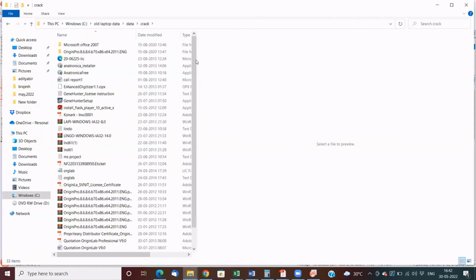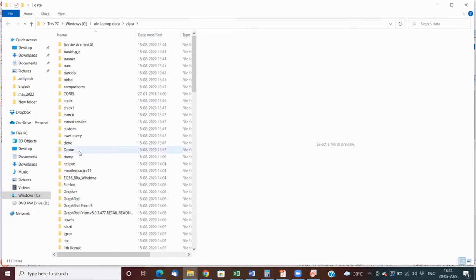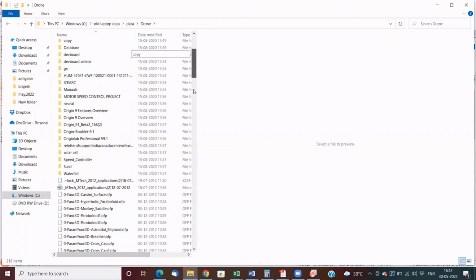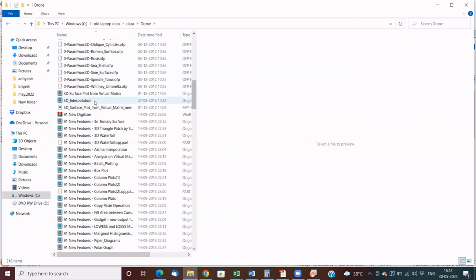Okay, so here I have got some data which can be plotted real time.